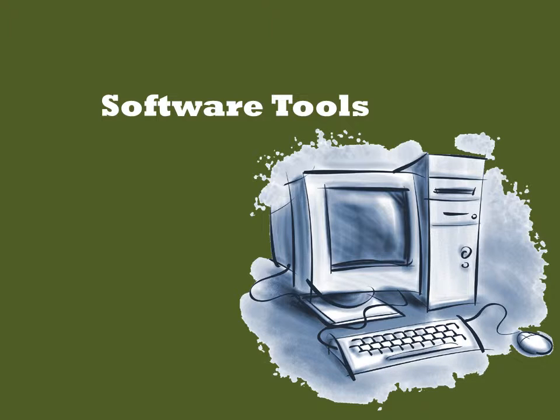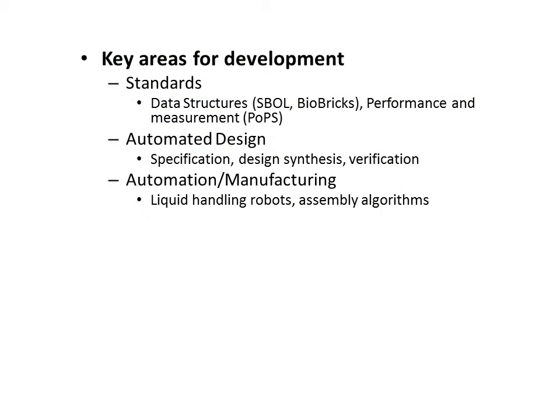However, the automation of experiments is not limited to operating robots, so let's take a look at the other types of software used for automating synthetic biology research today. Most software associated with synthetic biology is associated with standards development, automated design, or computer-aided manufacturing.